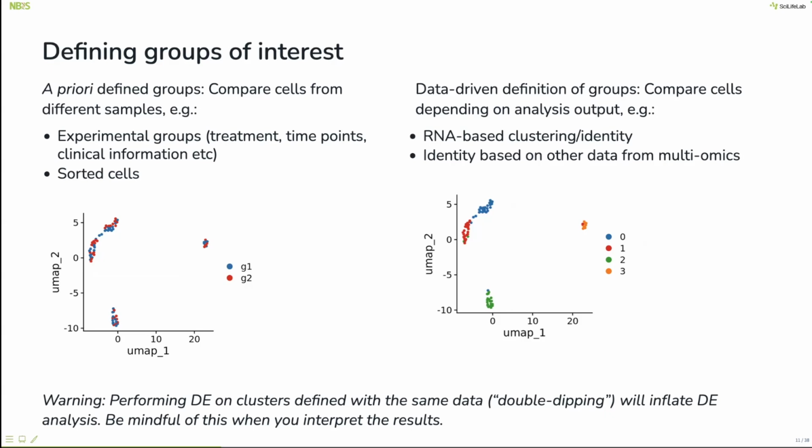Maybe you need to filter again. But in general, if they've been clustered in one cluster and then the UMAP looks like another cluster, they tend to have aspects of both. And if that's enough to shift your differential expression, then you should probably go back and check why that is. Thank you.